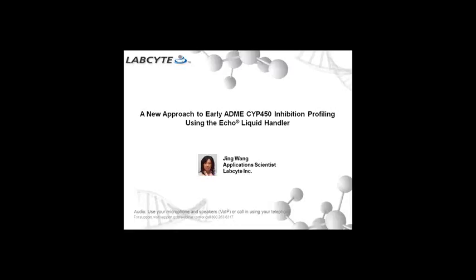Thanks, Joe. Hello, everyone. Thank you so much for coming to our webinar. Today, I would like to introduce a new approach to early ADME profiling, particularly in CYP450 inhibition by using the Echo Liquid Handler.